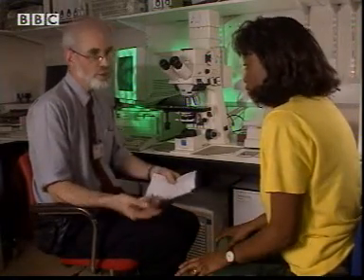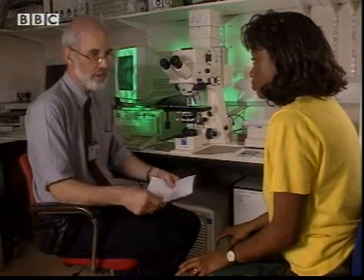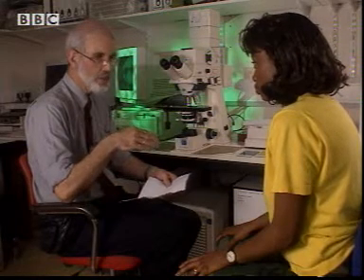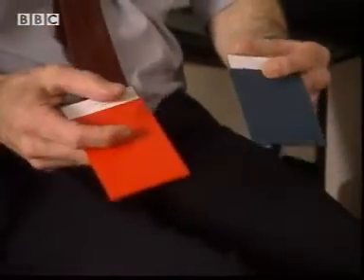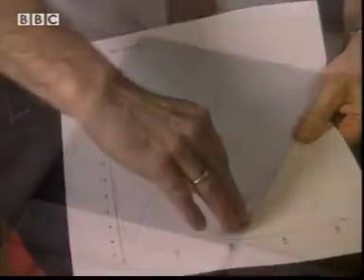Well, when you look at red paints, there are lots of different shades. I mean, you look around at different cars and you see probably those 5 all had different shades. And even if they look exactly the same, when you look at the way that the paint is actually reflecting the light, you'll probably find that one red has got a bit more blue in it and the other red is more orangey. Peter can use a special machine to measure how different colours reflect white light, which of course is made up of all the colours in the visible spectrum.